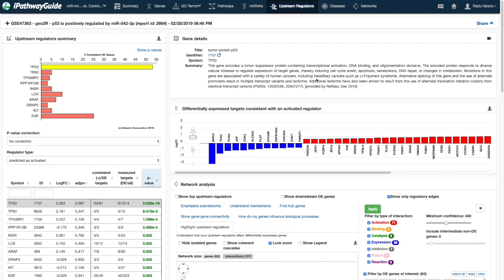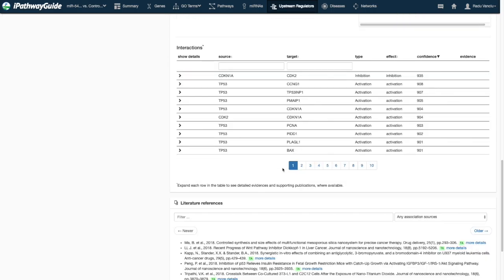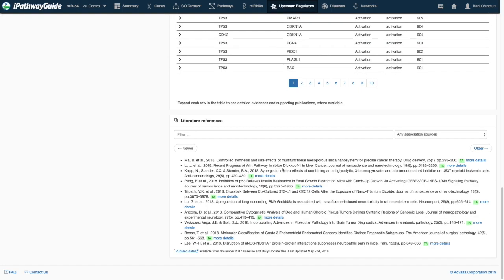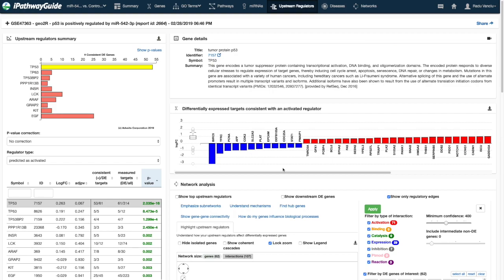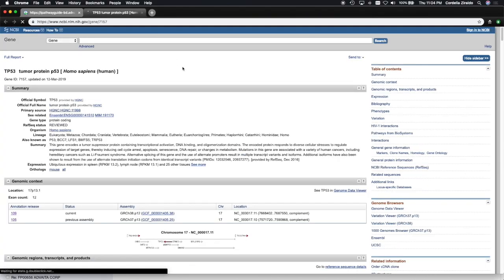There are four sections in the Predicted Upstream Regulator's Details section: Description, Consistent Target Genes, Network Analysis, and Literature. The Description section shows the gene symbol and a brief description of the upstream regulator, along with a link to an external site with additional information about the selected regulator.